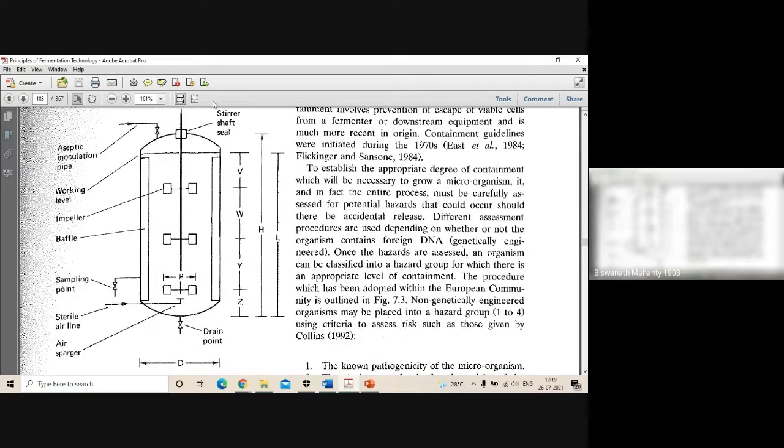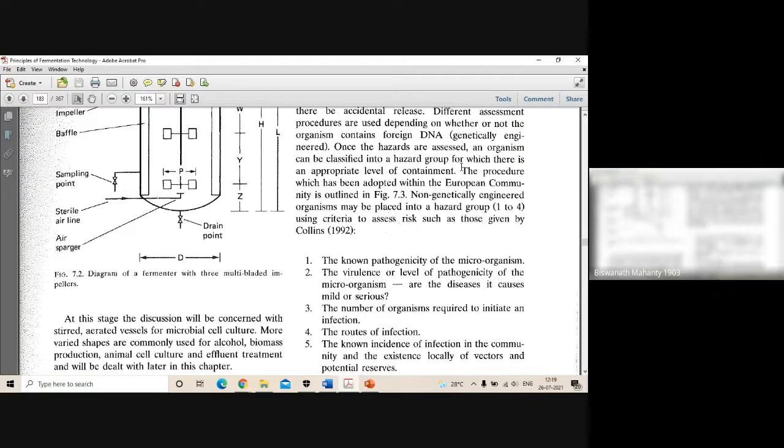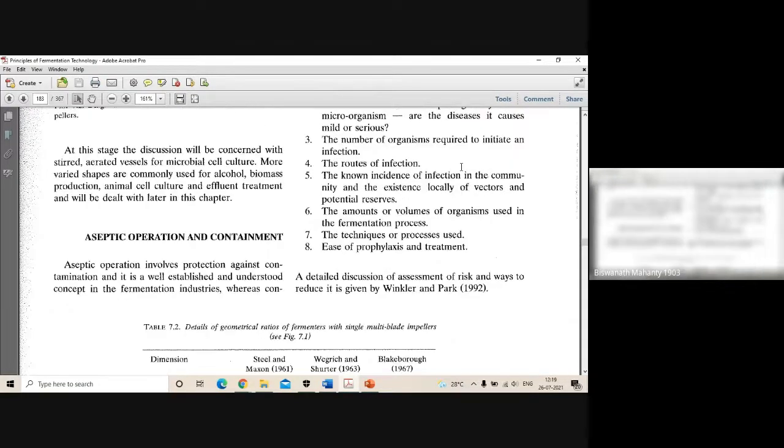You can see this diagram here. They are giving some names. I don't bother about the names. But my point of discussion in this class is that we should understand that all aspect ratios are mostly fixed in most industrial bioreactor systems. They do not vary much. Okay, some changes may be there, but they do not make much difference in this process. So these things are requirements.